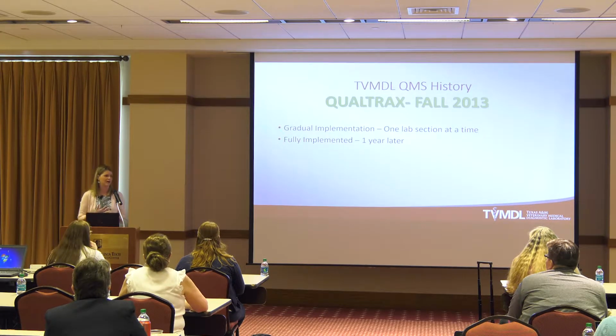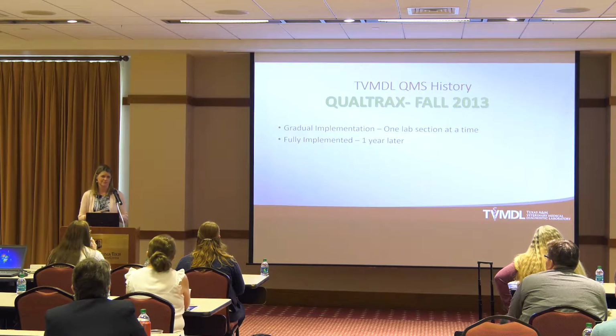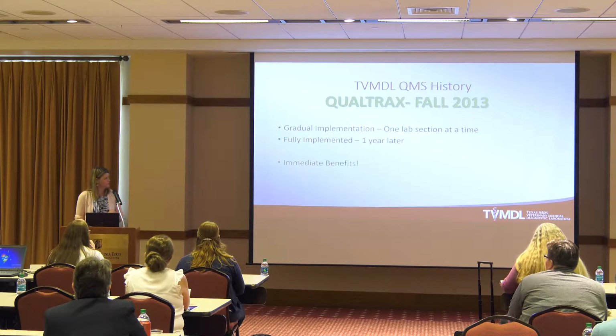Also, around that same time, we acquired a new LIMS. And so we figured it would be very unpopular with employees to implement the new LIMS and Qualtrax all at the same time. So the new LIMS was required by the A&M system because of security reasons. So we let that take precedence. It got implemented, and then we brought on Qualtrax gradually. Looking back, we think that was a really good way to do it. People got used to it a little bit at a time and change a little bit at a time.